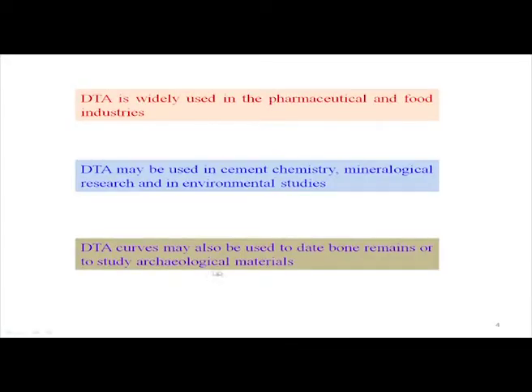And it can be very much useful for archaeological studies also. So, it can be used for dating, that in the dating we know the radioactive dating, and the bone remains, because the bone, the remaining bone part of the living organisms or the simple dinosaurs and all. So, the bone remains can be analyzed initially by this particular technique to study the archaeological materials what we basically unearth from the earth surface, and down the earth surface also we find some unknown material.